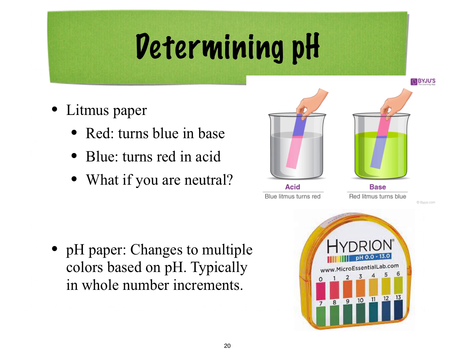So when you dip the little strip of paper in and it changes the color and you compare it with the color on the side of the container and you're like, it looks like a 2, maybe a 3. Well, that's really the best you can do. And what if you're colorblind? Maybe you have color blindness and you can't tell the difference between your shades of red or your shades of yellow and shades of green. So this is not perfect, but it is something that we've used and developed over time.